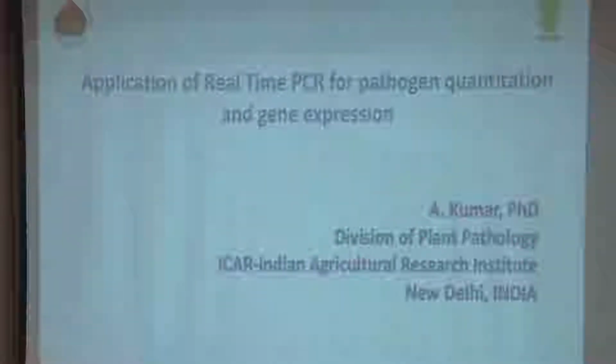The purpose of this lecture is just to let you know what is this real-time PCR and what are all the variants of this real-time PCR, and wherein we can use this real-time PCR in plant pathology and microbiology. Okay. So PCR all of us have done, correct? All 25 of you have done this PCR here, isn't it? So real-time PCR we will do tomorrow.